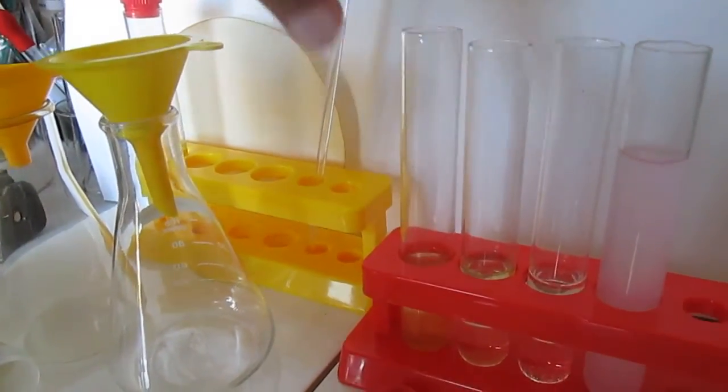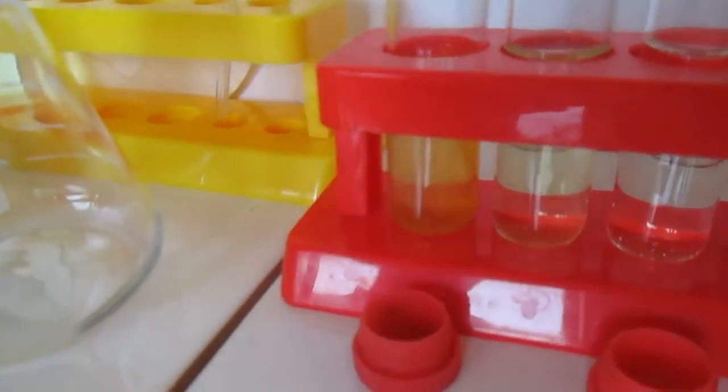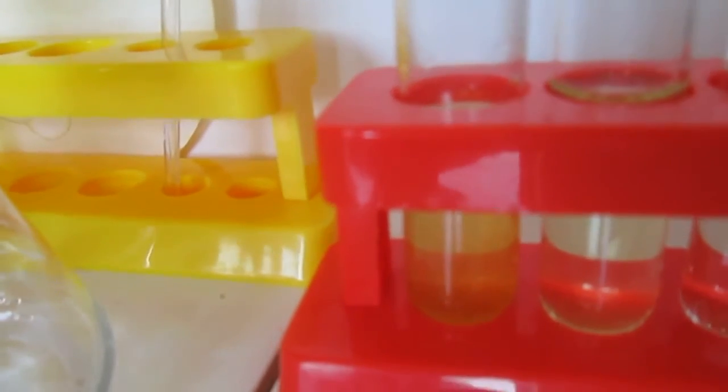In this first test tube I made a solution of ammonium iron sulfate. You can see that it is a very clear, very pale, brownish solution.